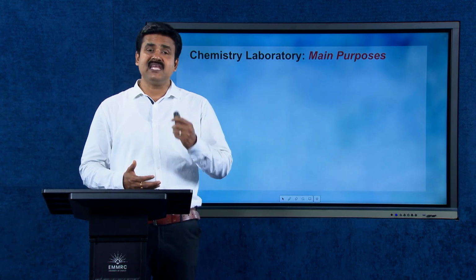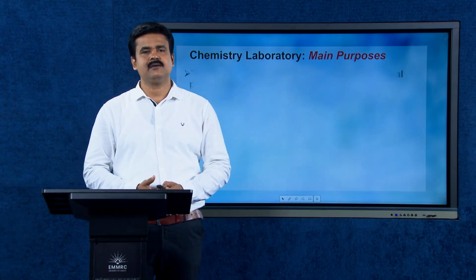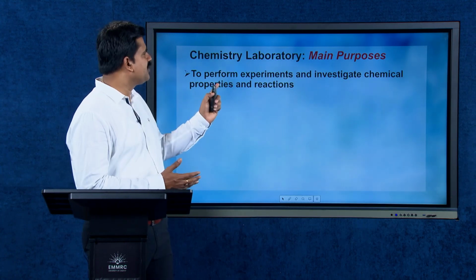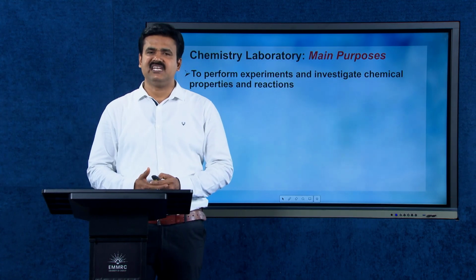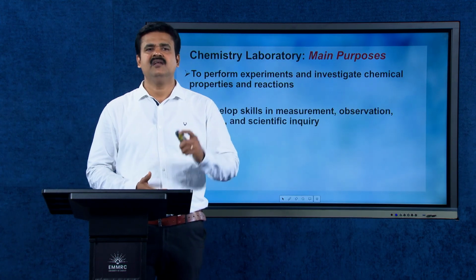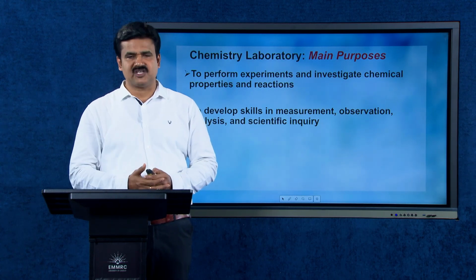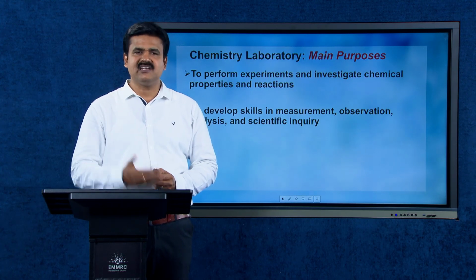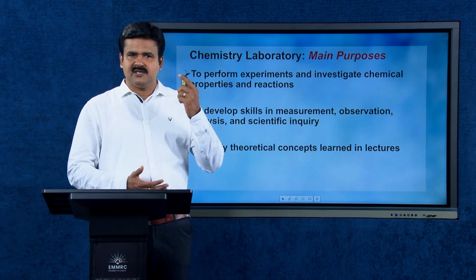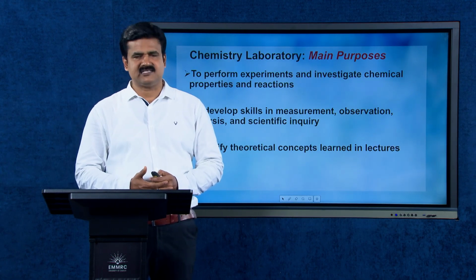Now, the main purposes of a chemistry laboratory are being discussed. The first purpose is to perform experiments and investigate chemical properties and reactions. The chemistry laboratory is also to develop skills in measurement, observation, analysis and scientific inquiry, and to verify theoretical concepts learned in lectures.